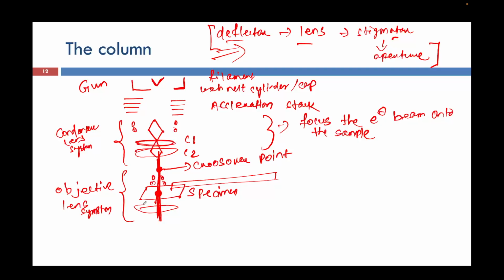The purpose of this is to produce the magnified image of the sample, right?